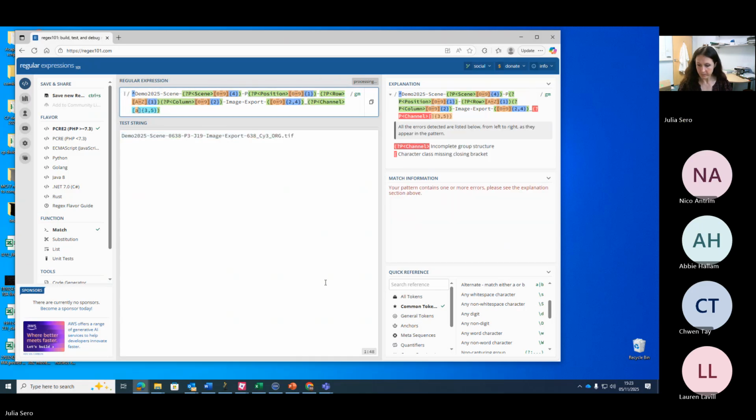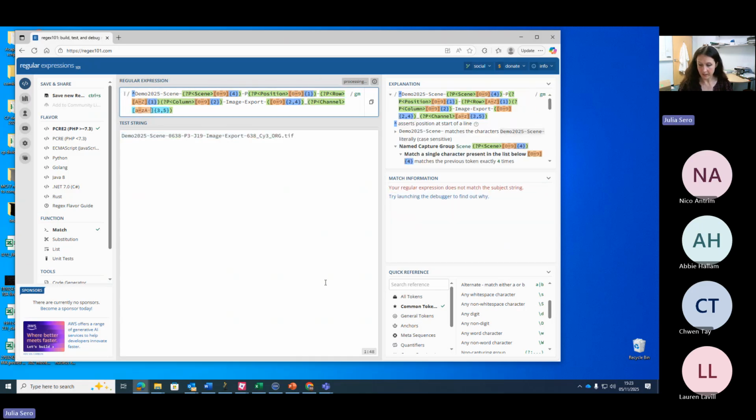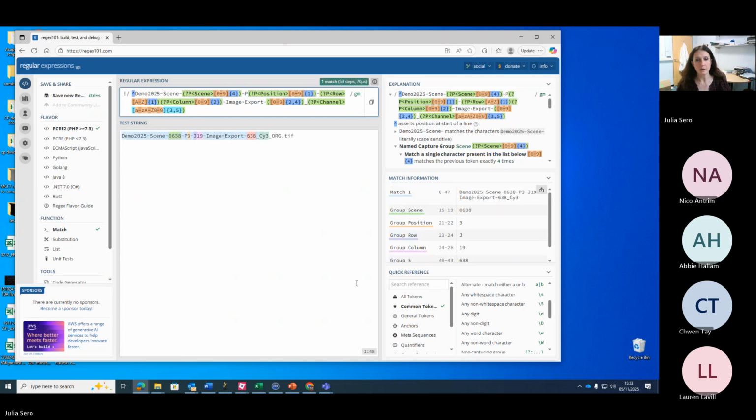I mean, if you don't mind it doing that, then that's fine. But if you do mind that, then you can be more specific. And it will give you exactly what you're looking for. There is some more bits of text, bits of string at the end of this, but don't care because we don't really need them, so we can stop here.